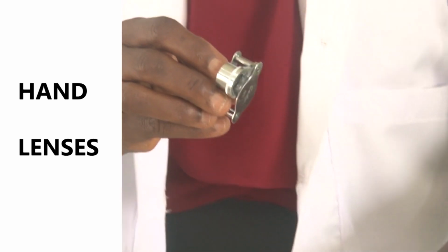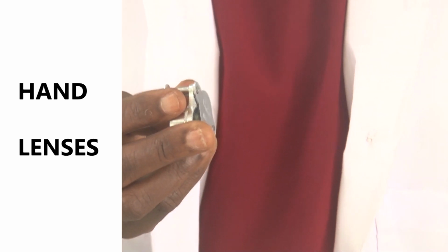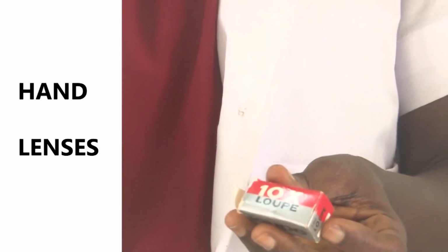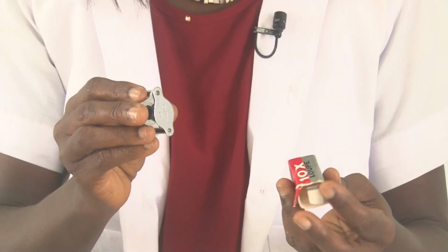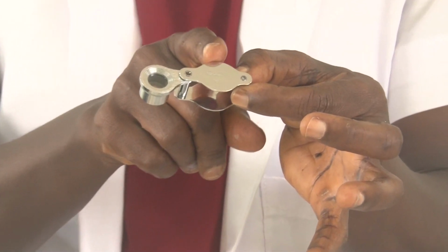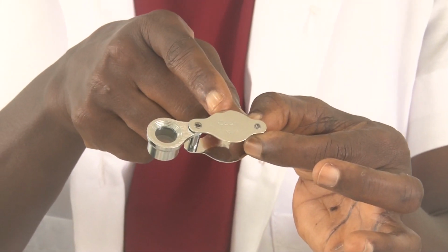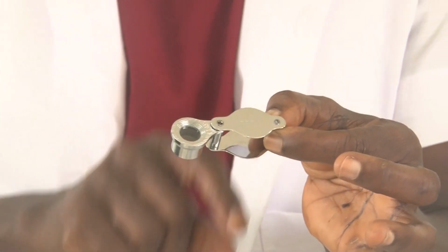And the magnifying power of hand lenses are written on them. This hand lens, this one, has a magnifying power of 10 times. And this 10 times is written on the frame of the hand lens. So that is the hand lens. This is the frame or handle of the hand lens. And the magnifying power is normally written on the handle or the frame. Right.